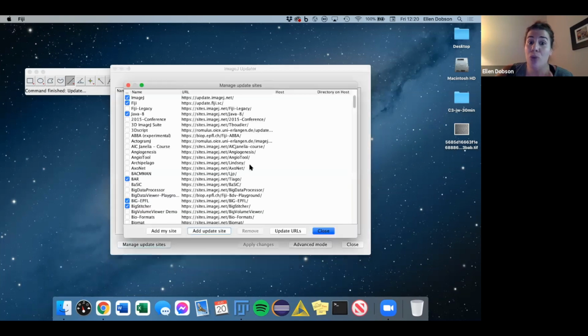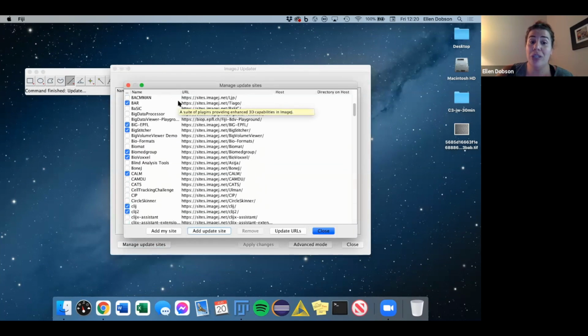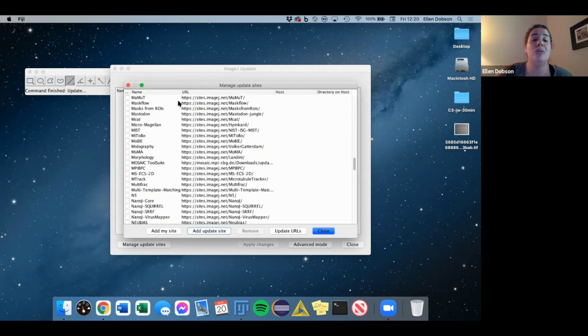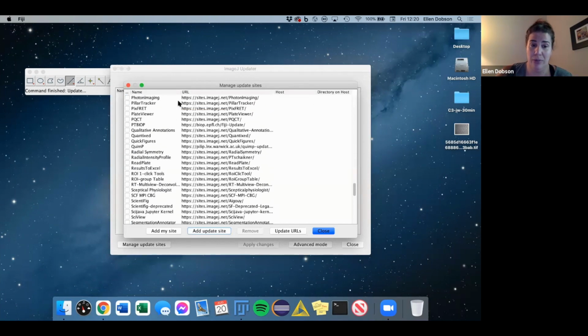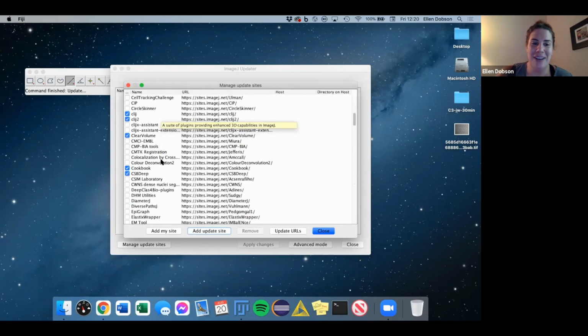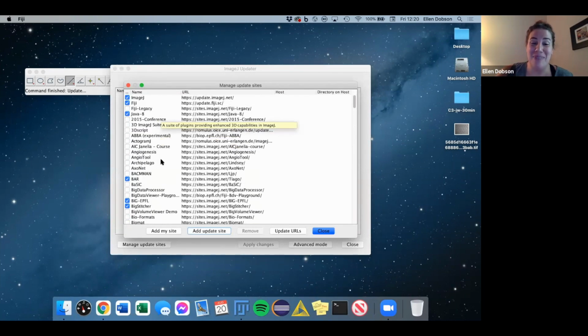So there's a huge list. If you click on that, there's a huge list of all these developers around the world who have built tools and want to share them with you. You can see a lot of them I don't even have installed. There's a lot, and there's more and more every day. I'm constantly building update sites for people. But there's tons of great tools and plugins that you can just enable. When you click on this check mark, it's called enabling an update site. So you'll hear that language on the forum and such.